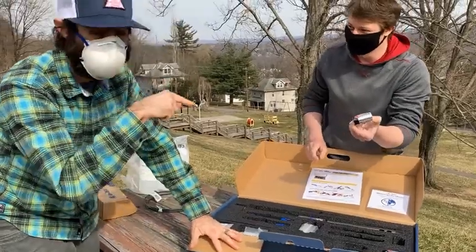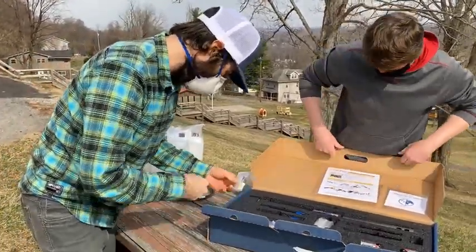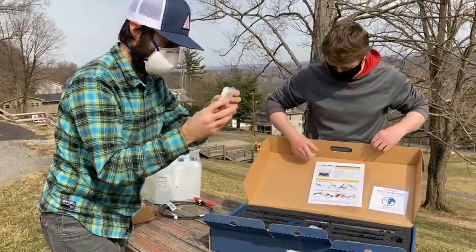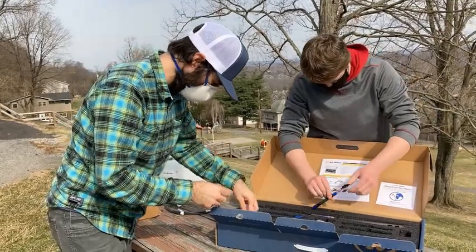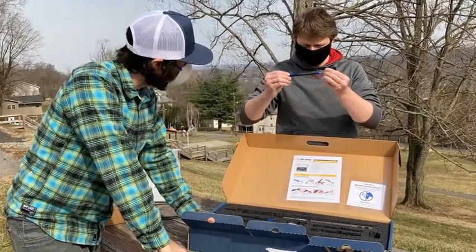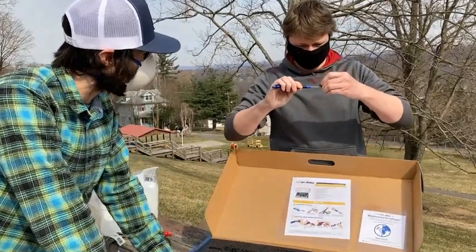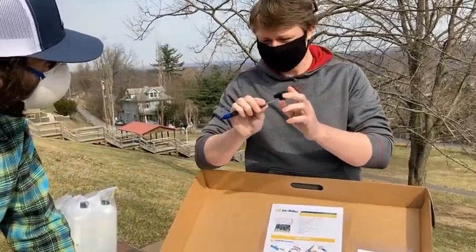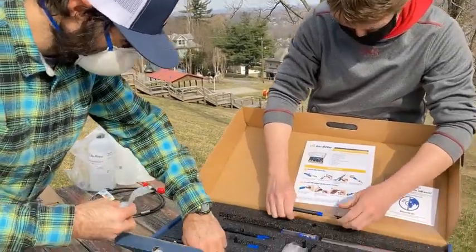Batteries included — that's what I'm talking about! So we've got an adapter, some more things, grease, cleaning tools. Oh look at that — are those brushes firm or soft, Jonathan? Those are very firm. All right, they'll go a long way in removing grit and dirt.